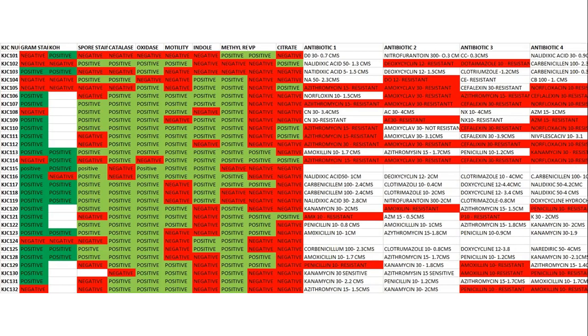Usually I see some people do not know when to stop adding ethanol during the decolorization step of Gram staining. When your gram-positive bacteria are heavily decolorized, they may appear pinkish, and light purple can also look pinkish. Also, what kind of lamp do you use in your microscope, white light or yellow light? Sometimes distinguishing between light purple and pink becomes very difficult. So I would suggest always complementing your Gram's observation using KOH.